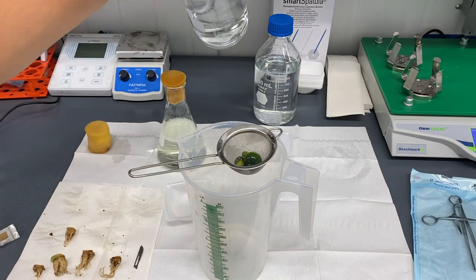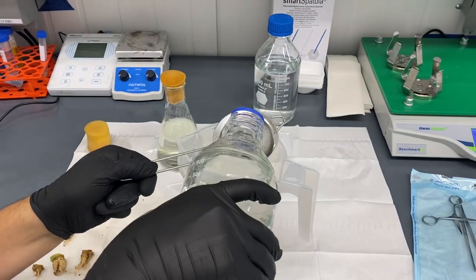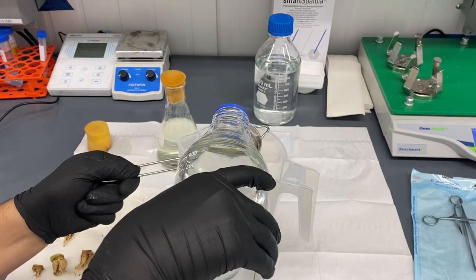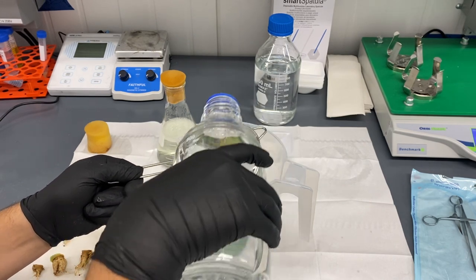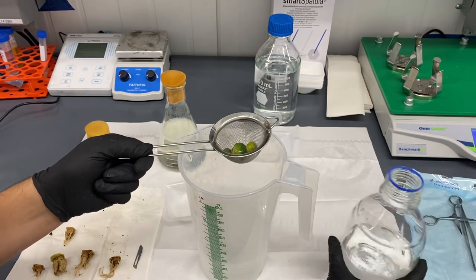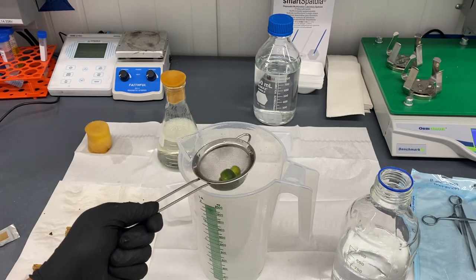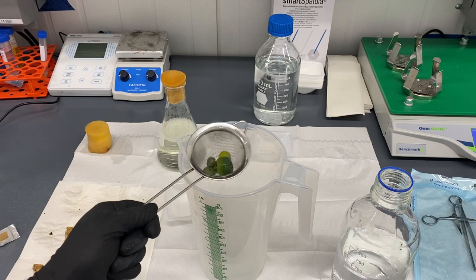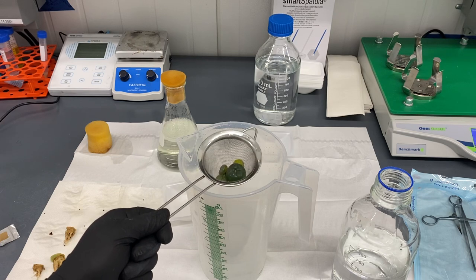I'm going to stop and give this a rinse with autoclaved sterile water. You pretty much want to make sure all the alcohol is off before it goes into the bleach, because isopropyl alcohol and bleach do not mix well - they'll actually kill the plant material rather than sterilize it. Now we're going to go into the bleach for about 25 minutes.